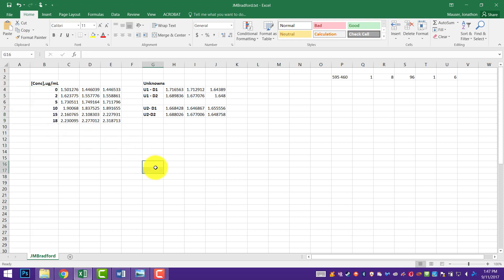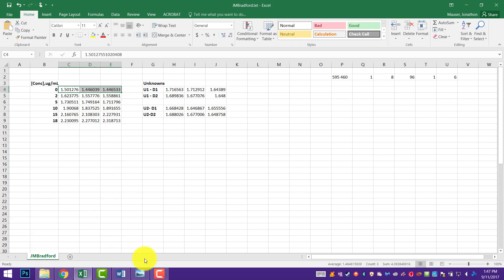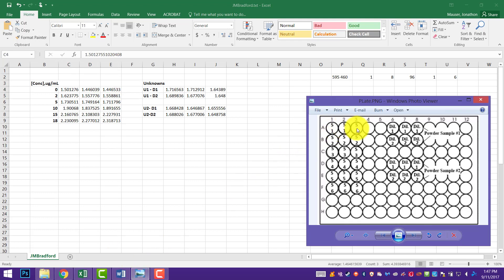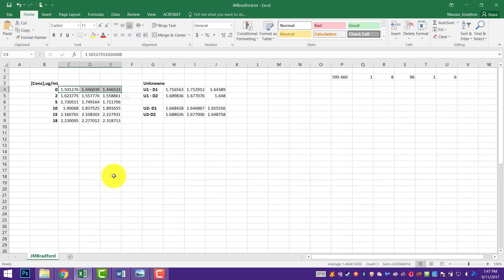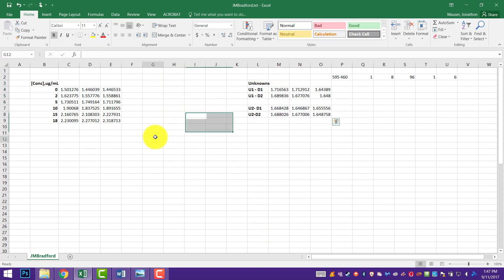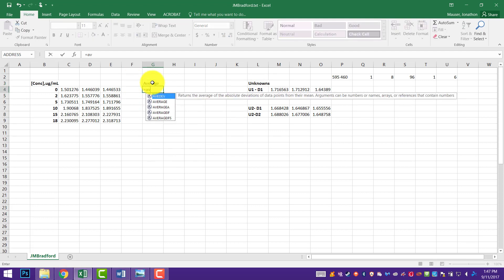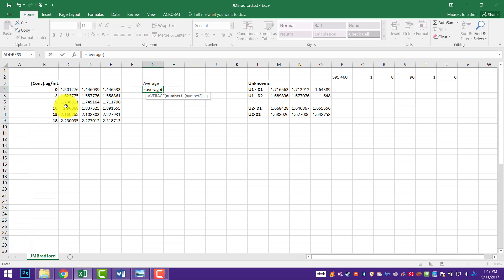The first thing we need to do here is to plot out our averages. Since these are all done in triplicate across the wells — you can see standard 1, 1, 1 on our plate map — I need to take the average across. I'm going to pick this up with the unknowns, cut it and move it over here so I have some room to work. Then I can do my average over here: equals average of these three wells. Those are my blanks.